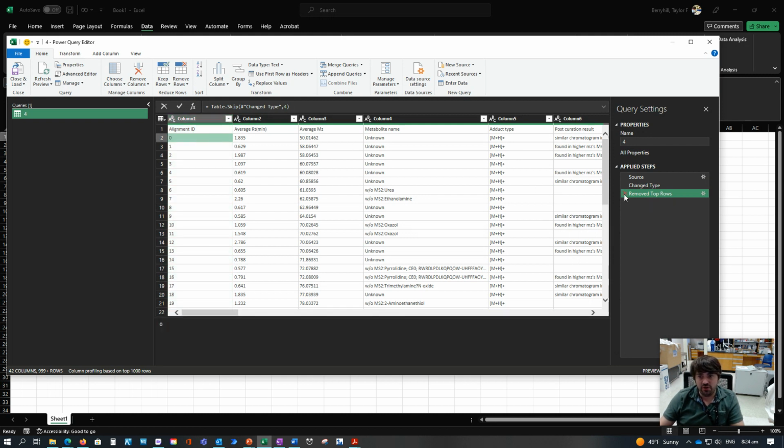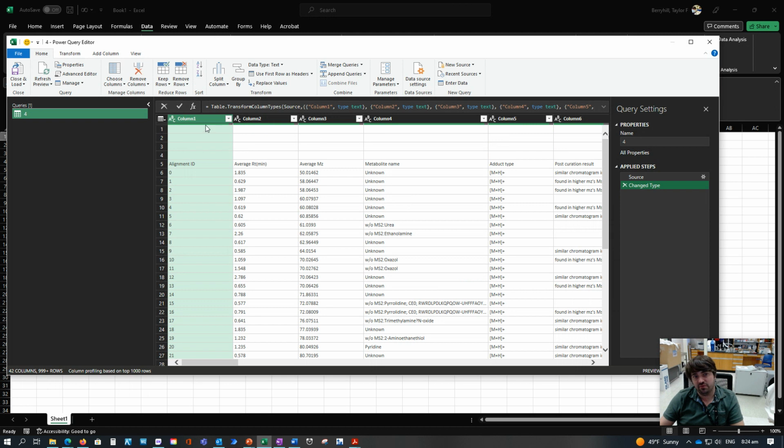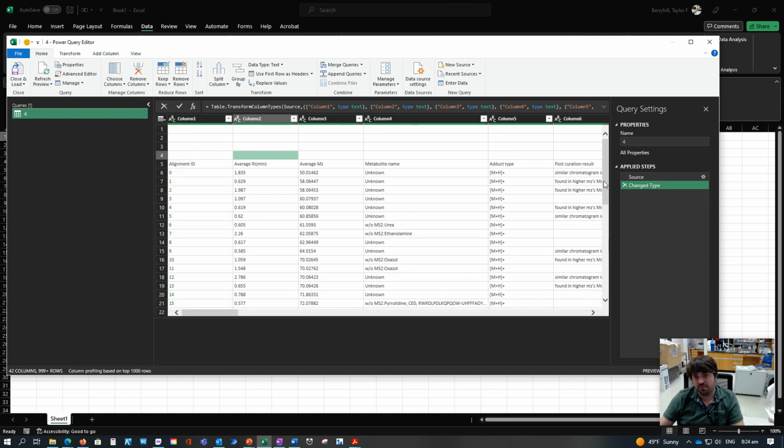So just to show you, say I deleted the top 5 rows or the top 3 and I need to take that back, you can come over here, hit this X, and now we reverse what we just did. So that's very nice. Say you mess something up 4 rows up, you can delete everything, go back and rework it. And once you dump this in Excel, you can actually come back here, which is the other nice part. So again, we want to delete the top 4 rows, hit 4 here.